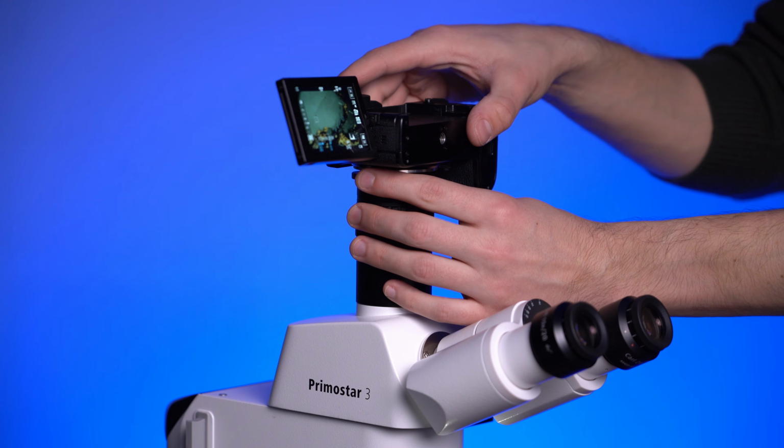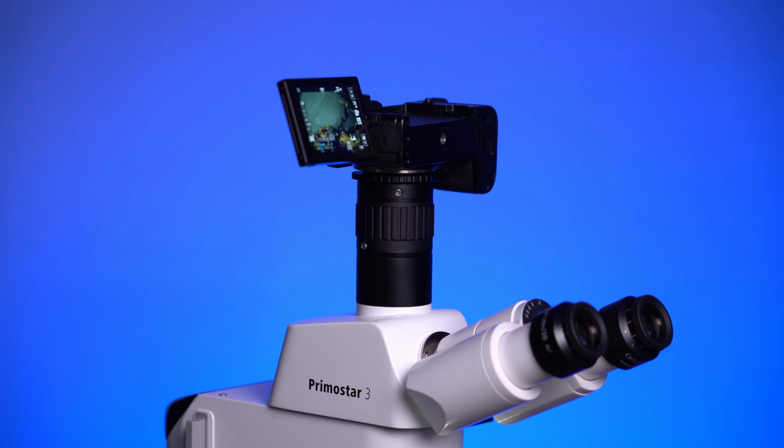Now let's talk about microscopes. Starting conditions. Budget around $1,000. Goal: maximum image quality and ability to shoot HD or 4K video to share with friends on social media. I'll talk about cameras and all the recording features at the end. For now, let's focus on microscope options. Your choices are actually pretty limited.